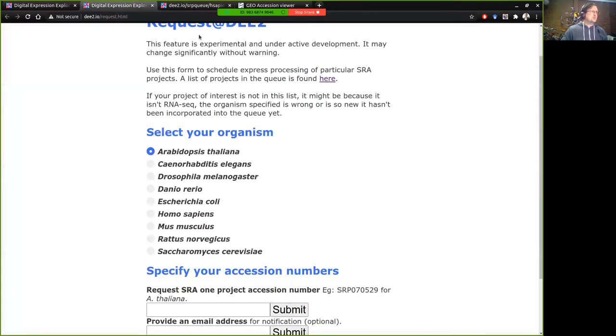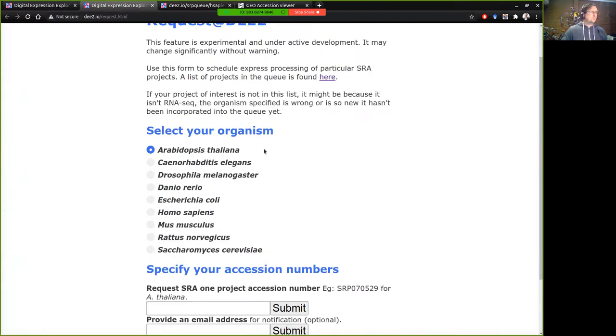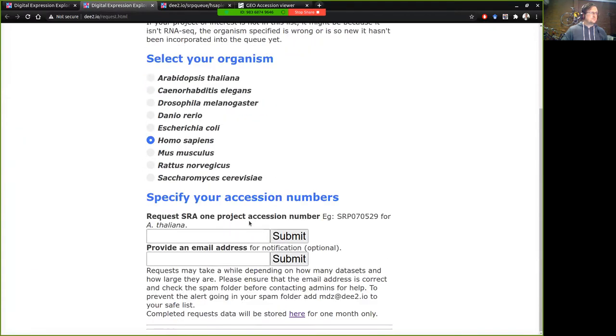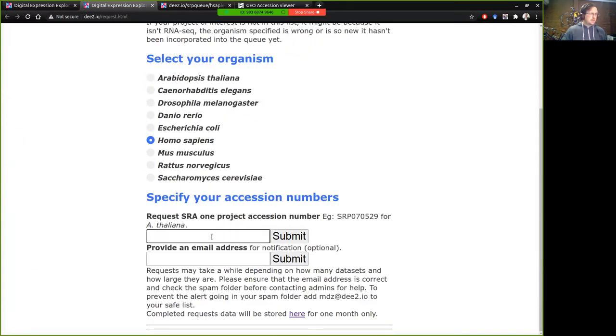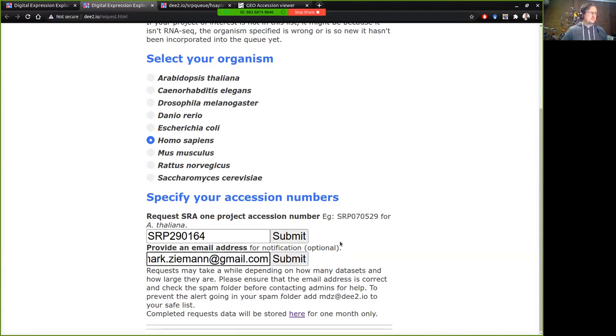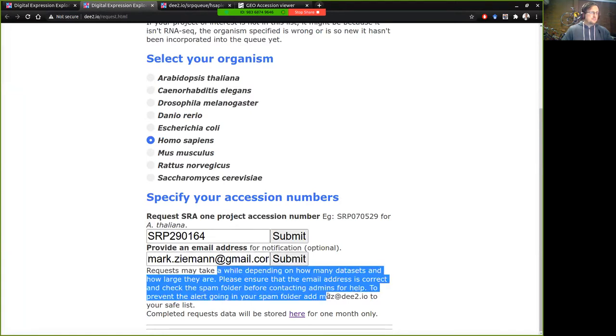So we can return back to the request web form. We can select Homo sapiens because that's the organism of interest here and I'll paste in that SRP number and then I'll pop in my email address and press the submit button and what will happen is that it'll be added to the queue and I'll get an email notification when that is completed.